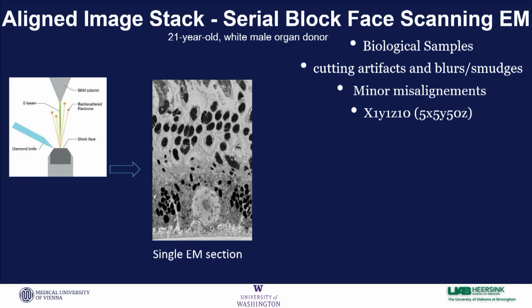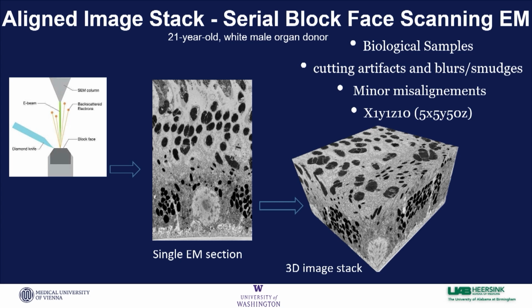And if you stack them all together in Dragonfly, you get a 3-dimensional volume. And this is not something that comes off the factory line. These are very individual samples, and they're biological samples, so there's a high propensity for artifacts or blurs or just things suddenly being different for biological reasons.